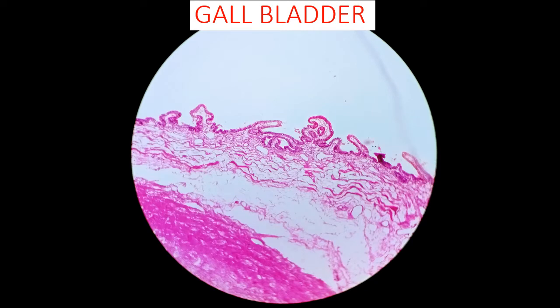Then moving to the gallbladder, how do we identify it? The gallbladder is lined by simple columnar epithelium with a brush border, and below that a fibromuscular wall can be seen. In the lamina propria of the gallbladder, elastic fibers can be seen. If you compare this with the small intestine, there we can identify elongated villi, but here we cannot identify any villi. It is tall columnar epithelium with a brush border, and the outer layer of the gallbladder shows a fibromuscular wall. So that is how we can identify the gallbladder.